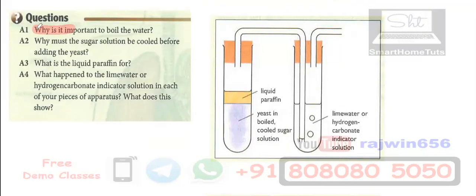Why is it important to boil the water? Can you state the reason for this? Yeah, it's important to boil the water so you drive off the dissolved air. Correct. You remove the dissolved air because we are studying anaerobic respiration, so presence of air is not required over here.